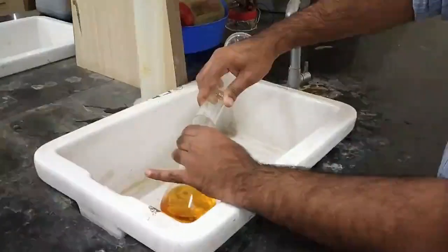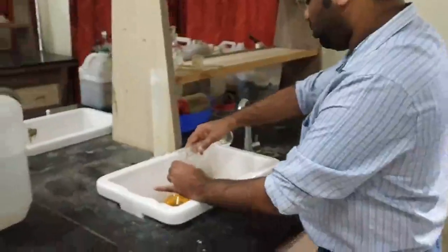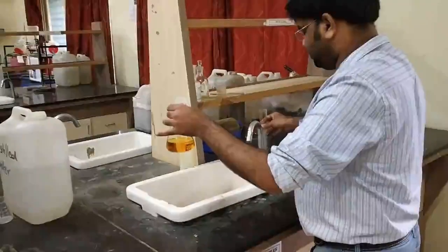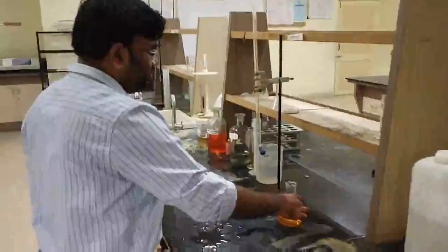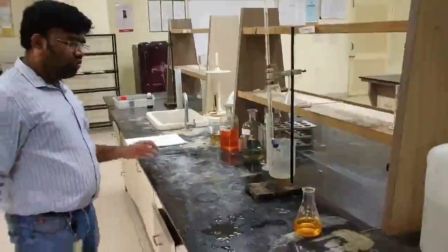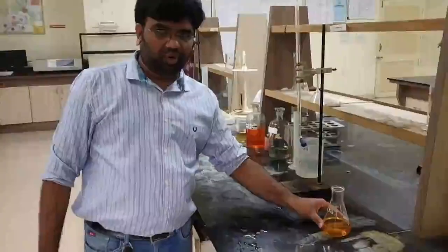And there is heat, it is an exothermic reaction, and the conical flask is going to get heated, right? If you check, the temperature is very, very high here. This is an exothermic reaction. The temperature is high, so we are going to cool this liquid for a few minutes. So we are going to keep it for cooling purpose.